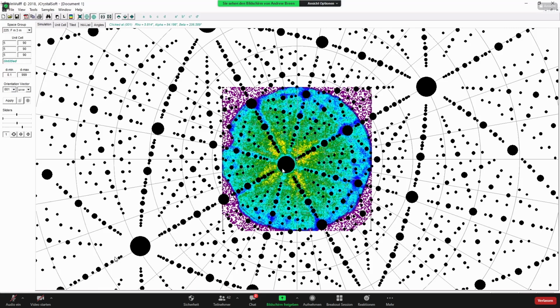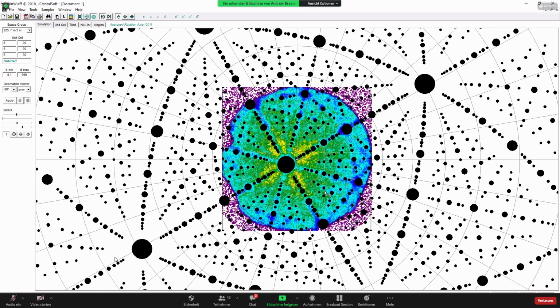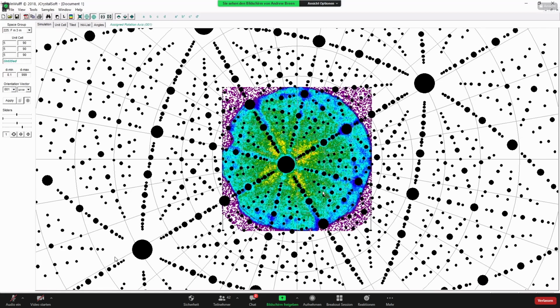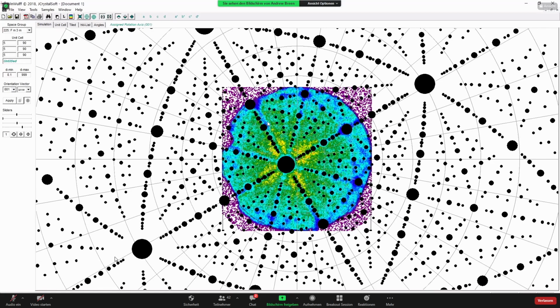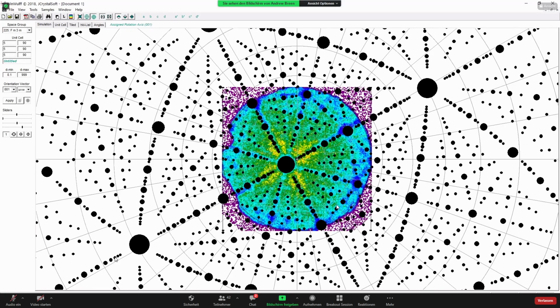So as you can see now, those patterns are pretty well aligned, right? You get the hang of it, you get the knack of it after a while, and you kind of see, okay, look, all these dots are matching up, these lines are matching up with these zone lines, and I'm pretty confident that I've got that indexing correct. So it takes a bit of practice, and you're probably going to make mistakes, but there's a few little checks you can do when you're trying to calibrate the reconstruction to make sure that you've indexed correctly.